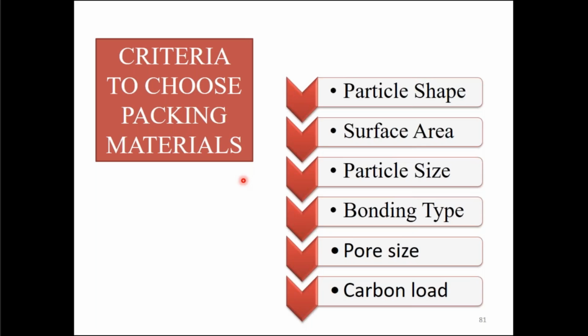The pre-column is mainly for purifying the solvent system, that is the mobile phase, because there could be some dissolved impurities which would have gone through the filtration and degassing procedures. So they are still there and can damage the column. To remove such impurities, we use a pre-column. And we have seen what it is, so I will not go through it again.